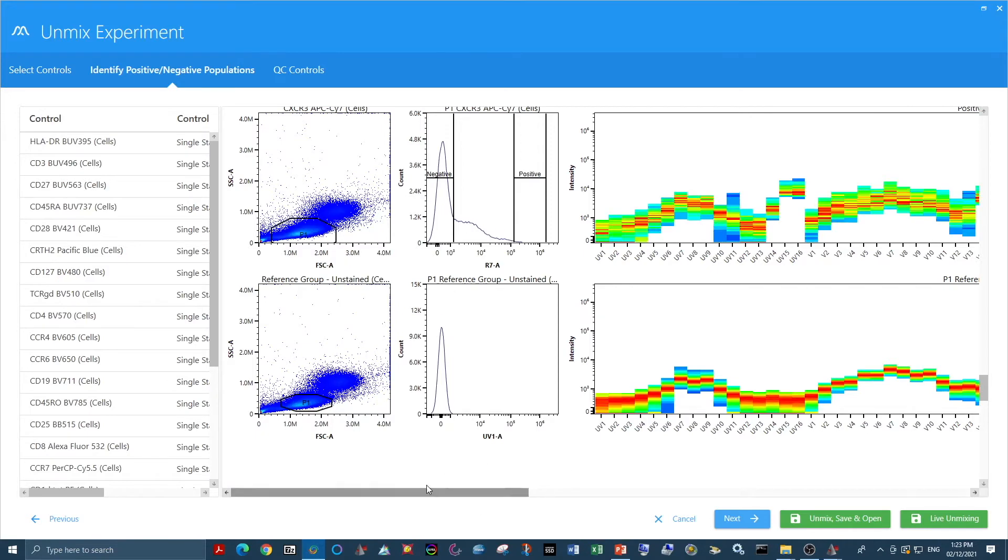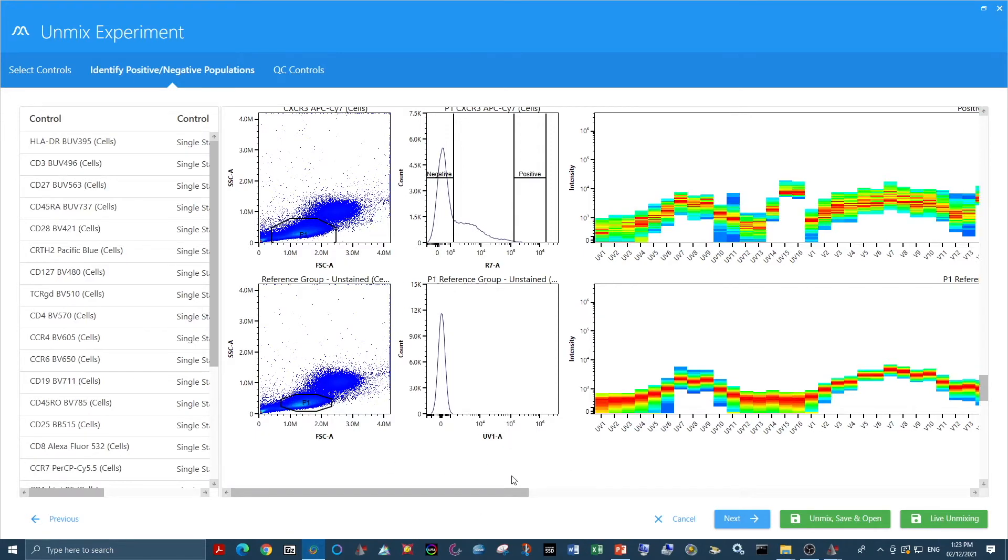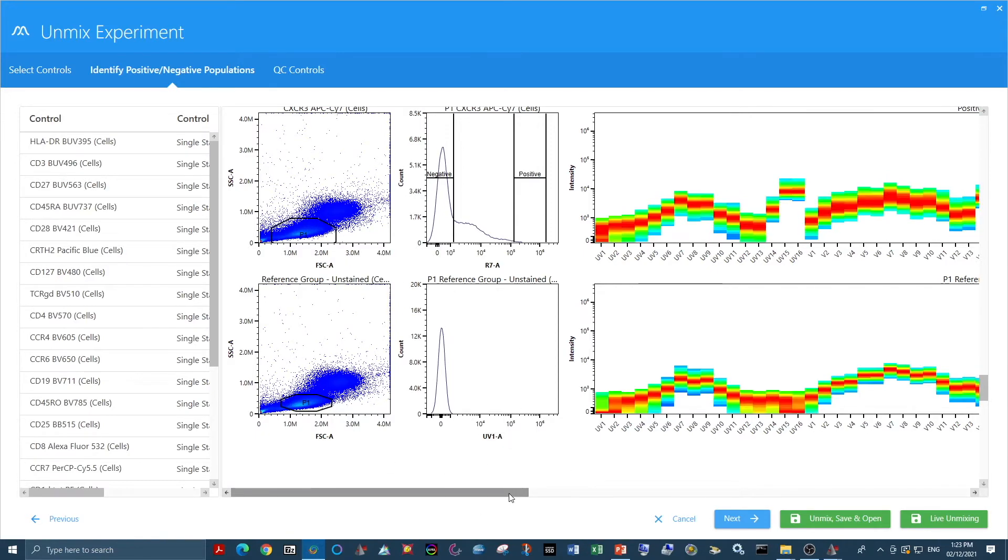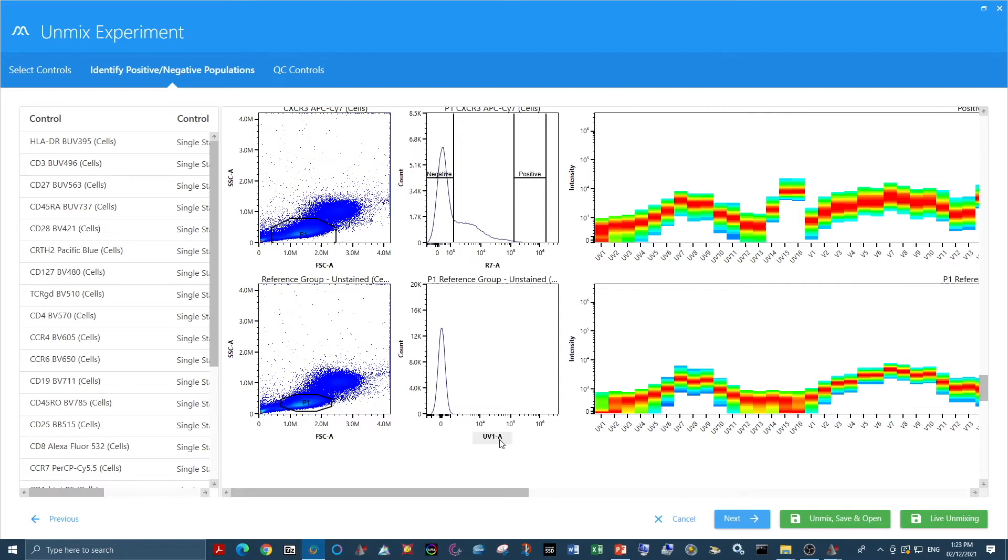Then I would go forward and unmix and check my n by n matrices, just like we did in video 2.1, and see how the unmixing works. And then I would do the unmixing again without autofluorescence extraction and compare the two results.